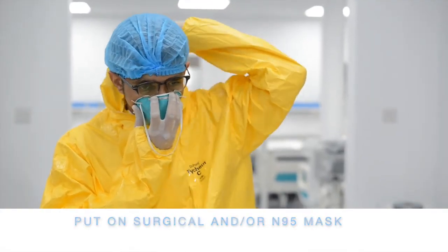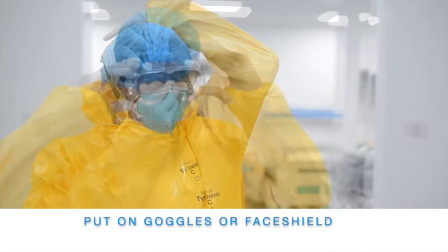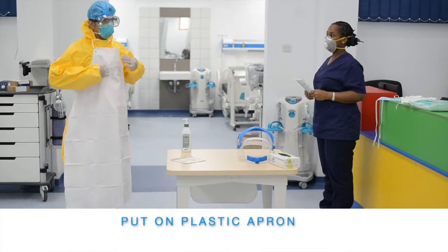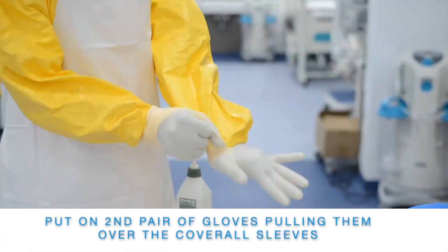Put on a surgical or N95 mask. Put on goggles or face shield. Put on a plastic apron. Put on a second pair of gloves, pulling them over the coverall sleeves.